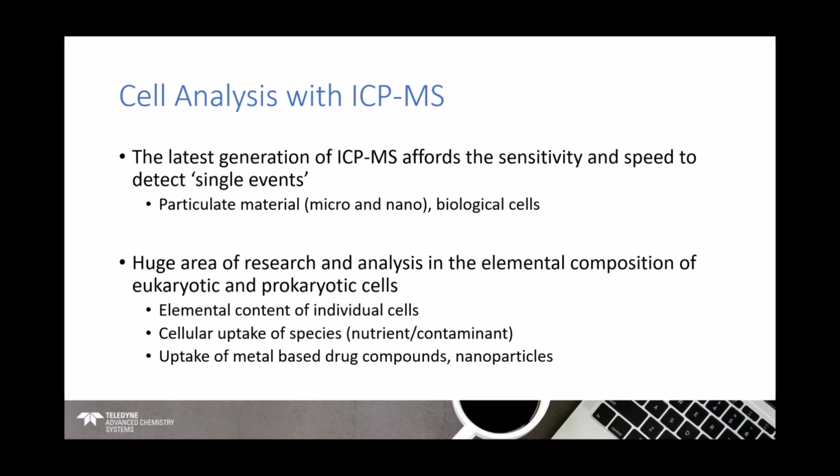Cells are studied as an entity themselves, or as part of a study or a project, as a means to an end, essentially looking at cells as part of a wider study. We could be interested in the elemental content of individual cells.